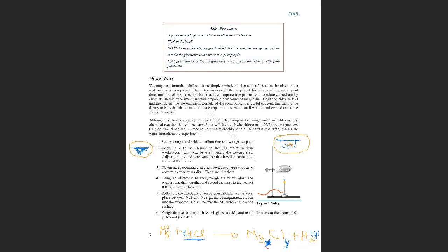And then you will start the flame just to evaporate all the water, because this is aqueous water, and it says here that you evaporate.